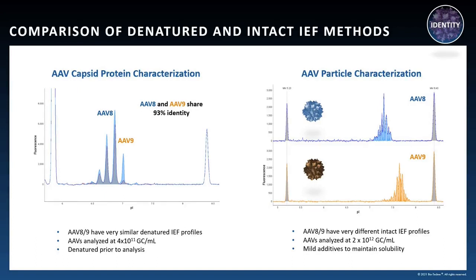Now that we have an intact method, let's discuss a little bit of the importance of examining AAV particles.